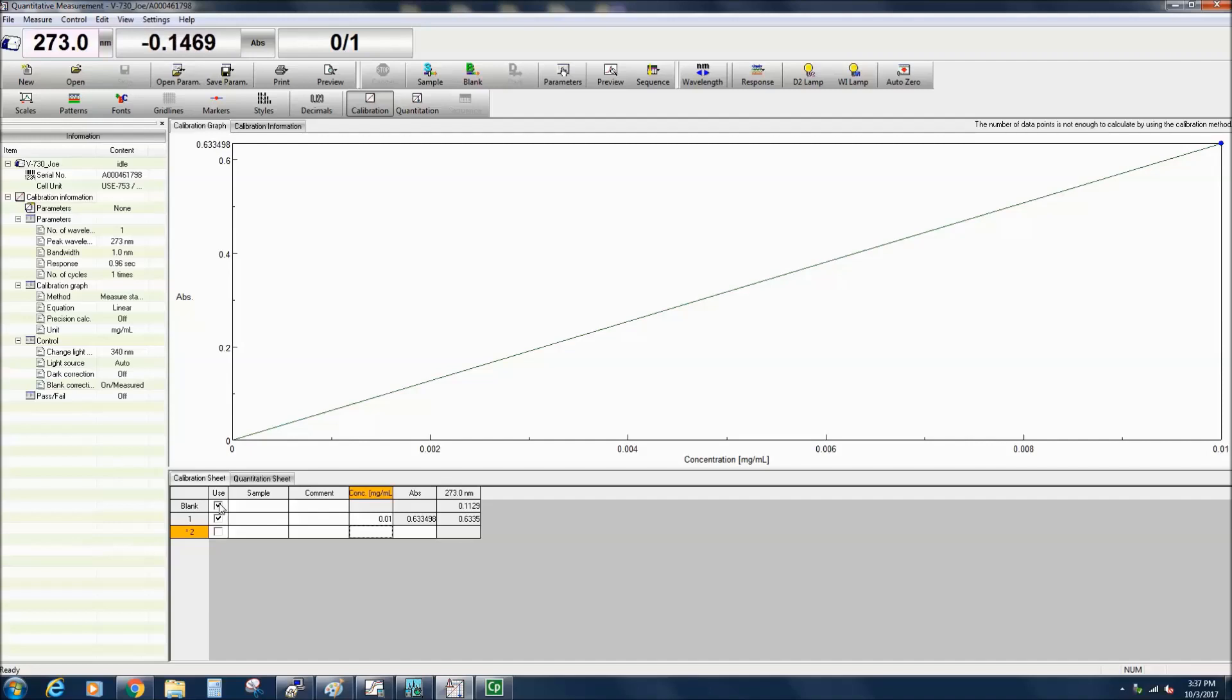The sample name, comment, and concentration can be entered either prior to the measurement or after. A new row is added for subsequent standard sample measurements.